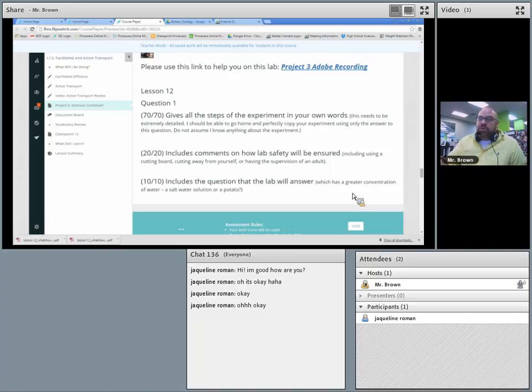Alrighty? So you're trying to determine which has more water, the potato or the saltwater solution. Okay? And I'll tell you how you're going to figure that out here in a few minutes.